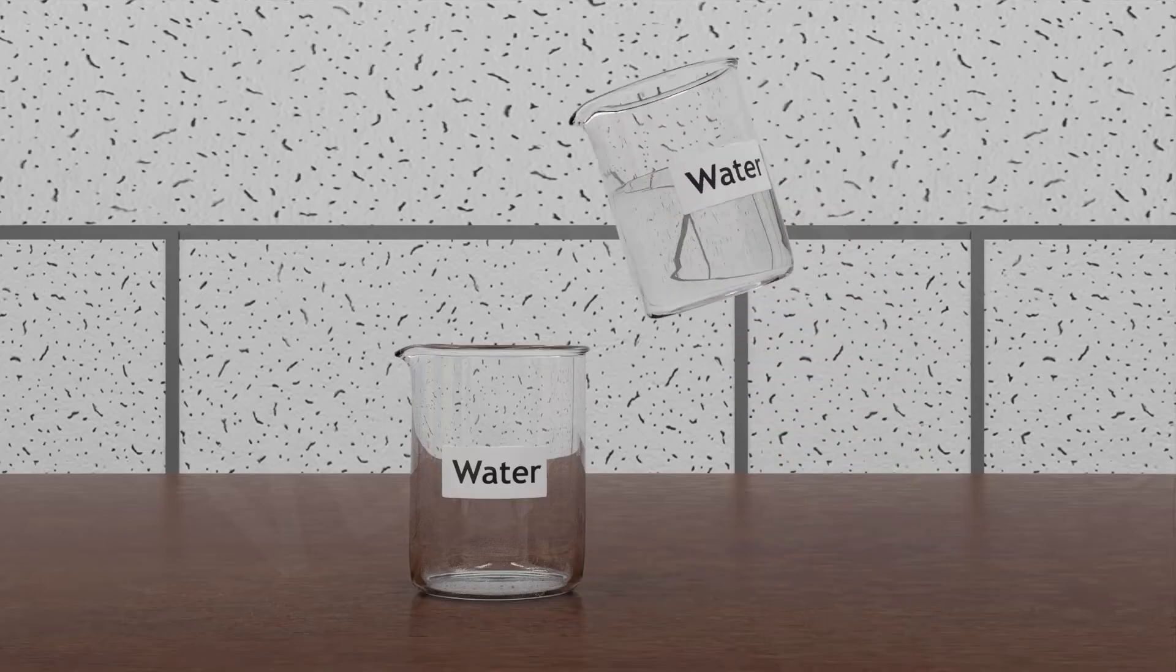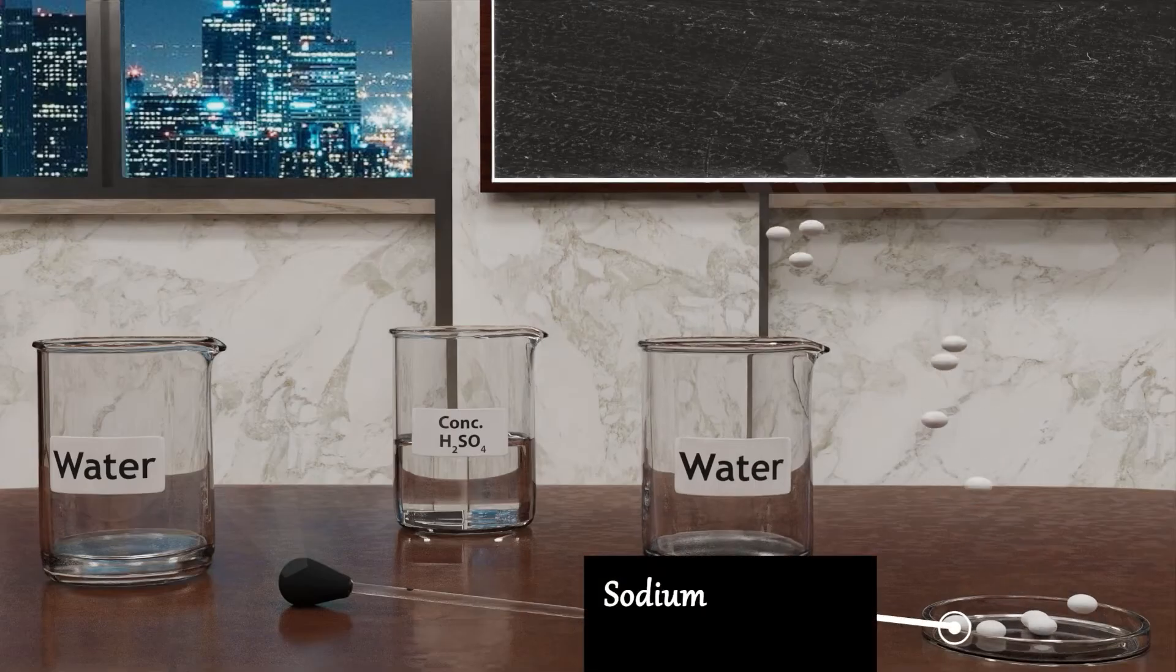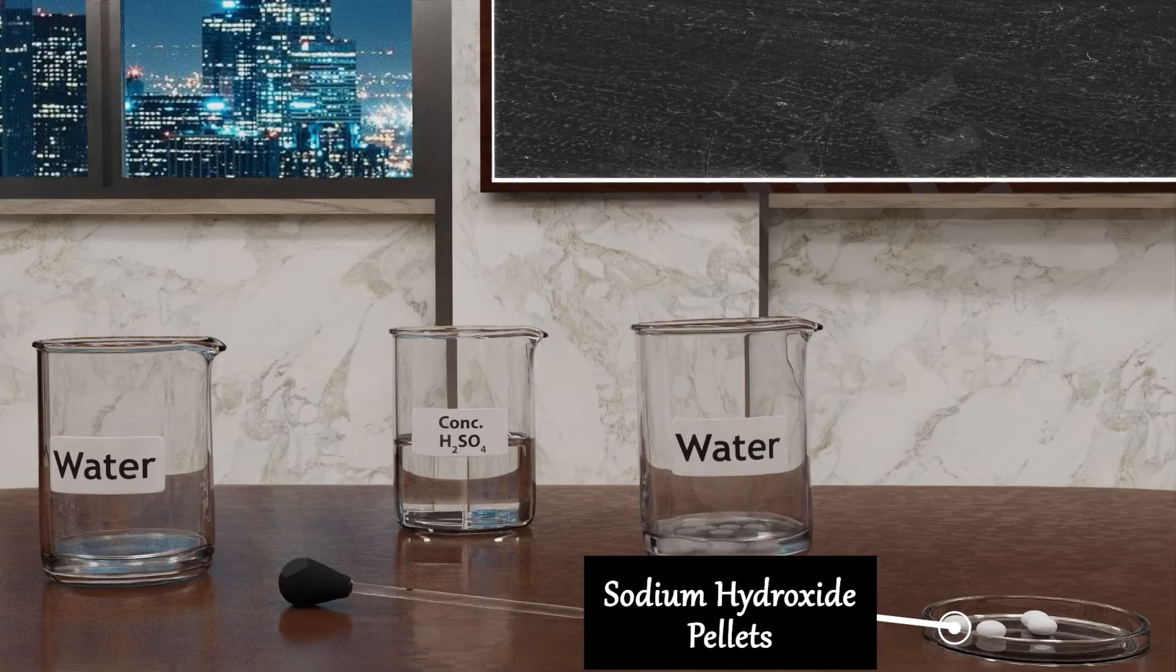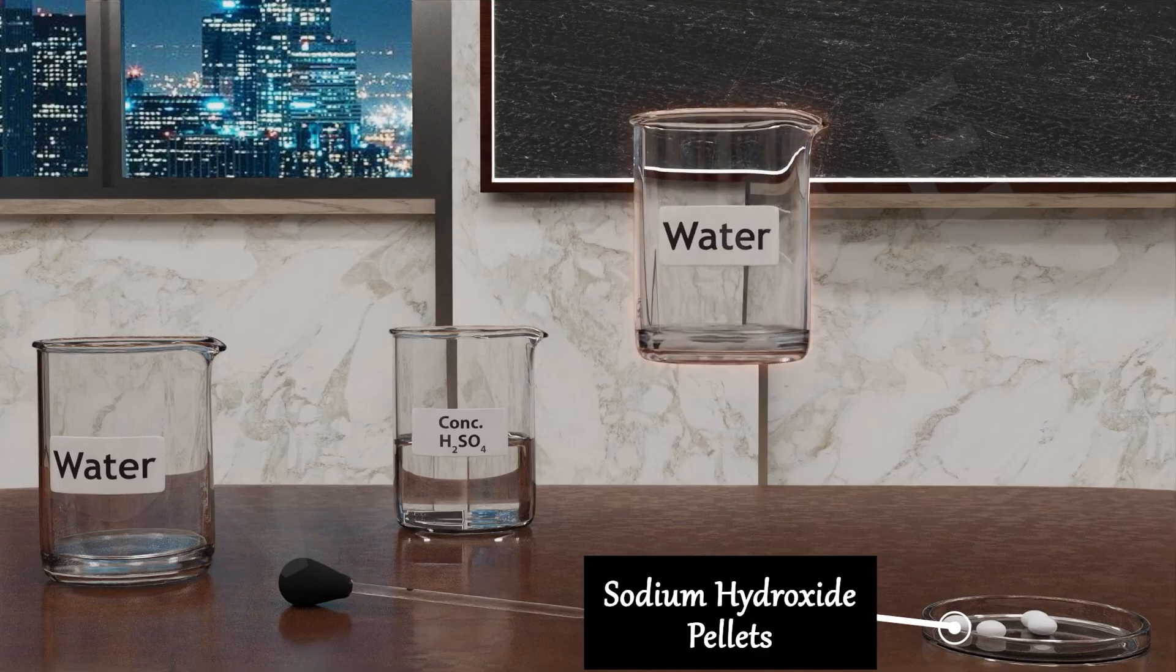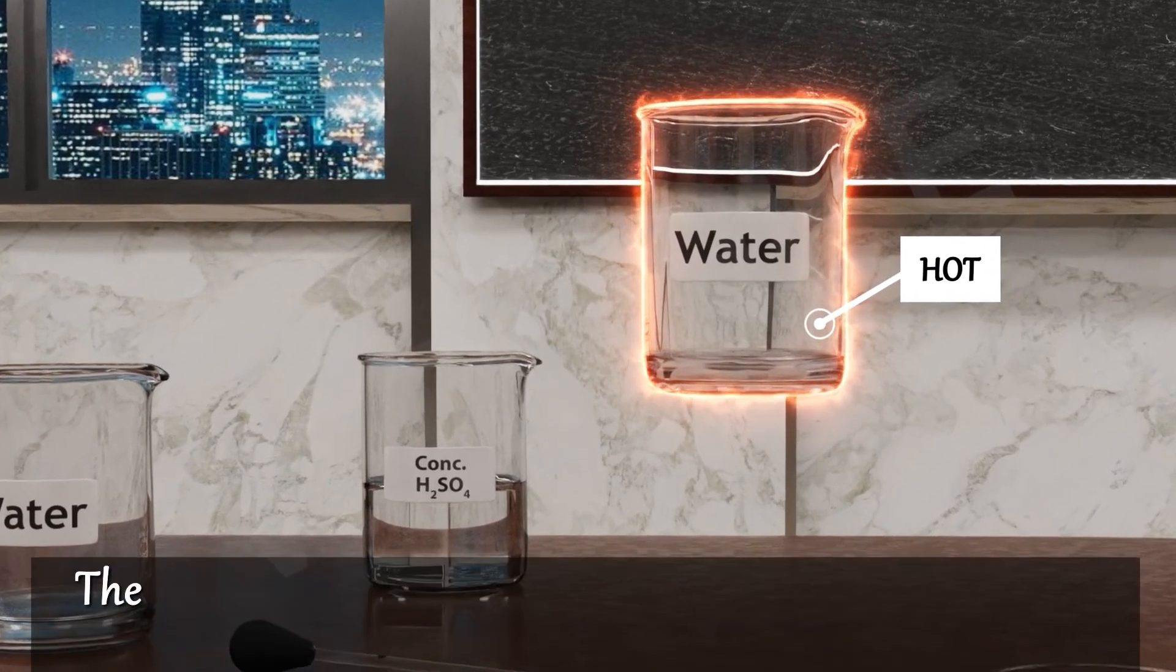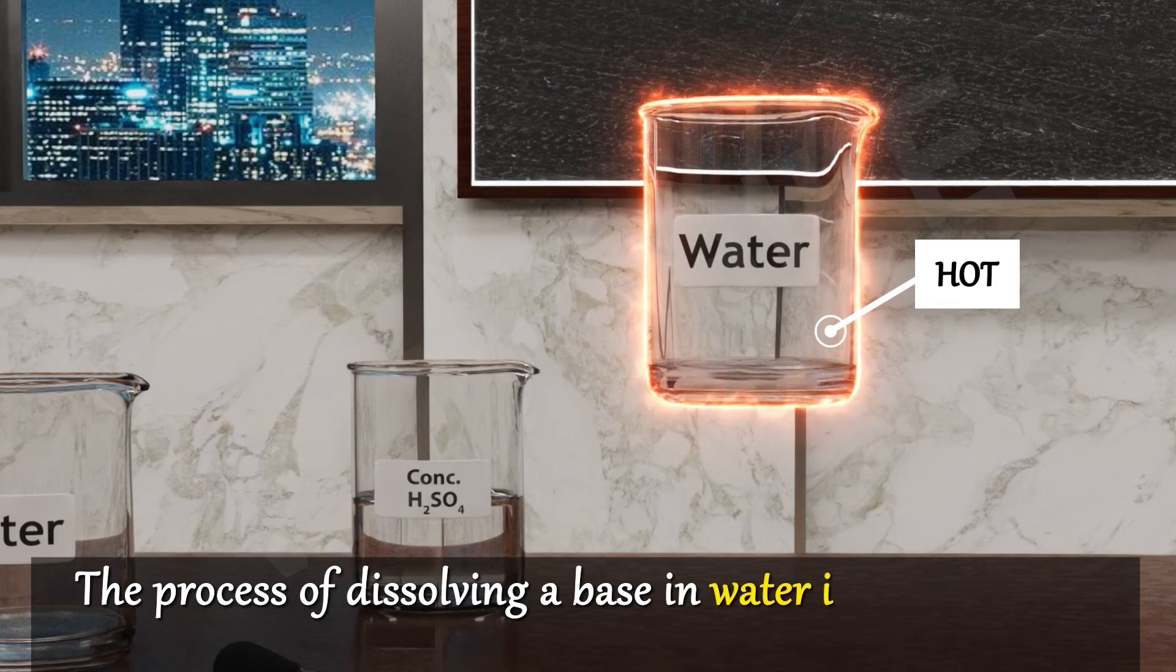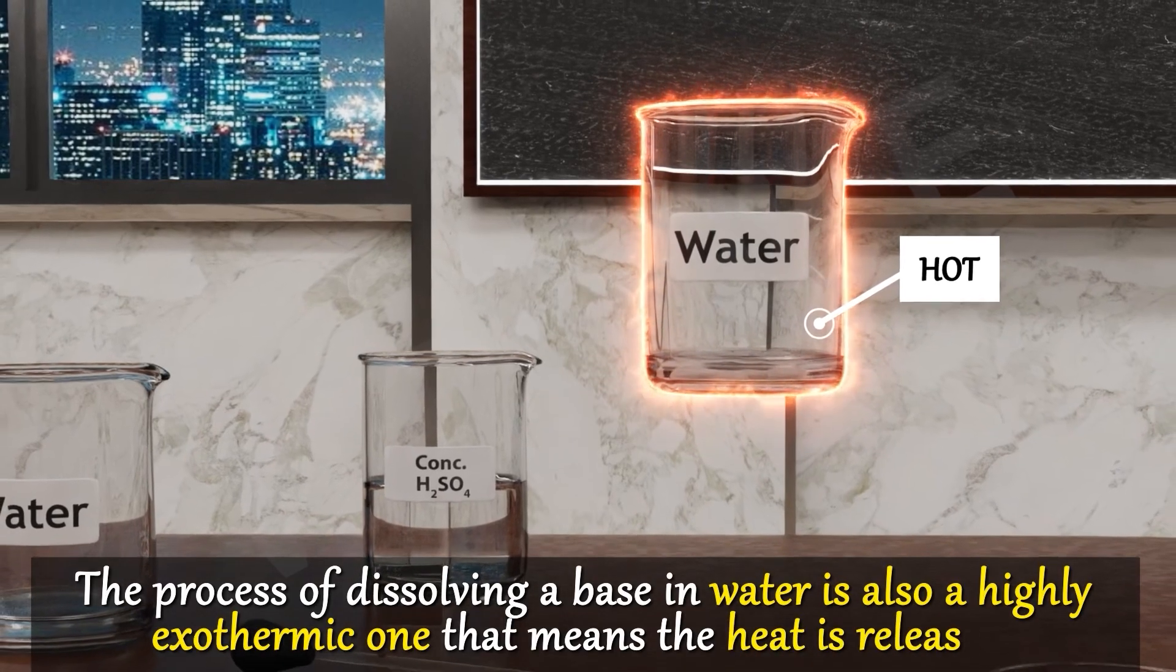So take again 10ml water in a beaker, add few sodium hydroxide pellets in it, swirl the beaker slowly. Now touch the base of beaker. Again it's become hot, means the process of dissolving a base in water is also a highly exothermic one, that means the heat is released.